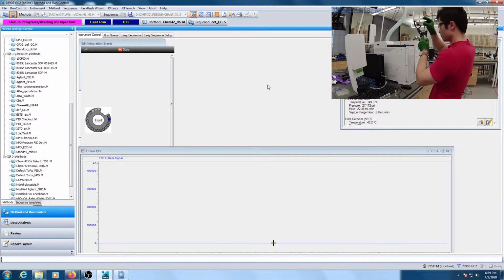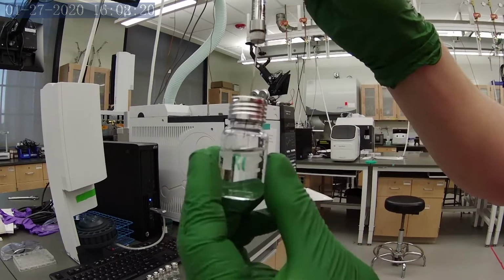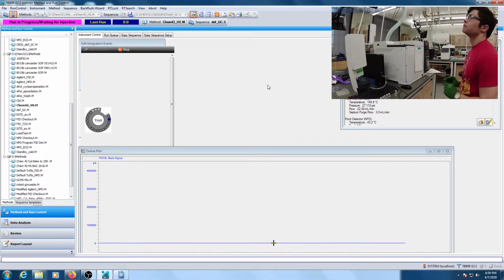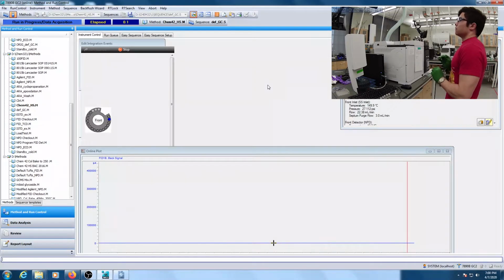And fortunately I had the foresight to show you guys what this looks like. I'm not actually dunking the needle into the solution, it's only going into the headspace portion. And then piercing the septum inlet, while at the same time pushing the plunger down, then hitting start on the instrument. And here I accidentally pulled the plunger out of the needle barrel.